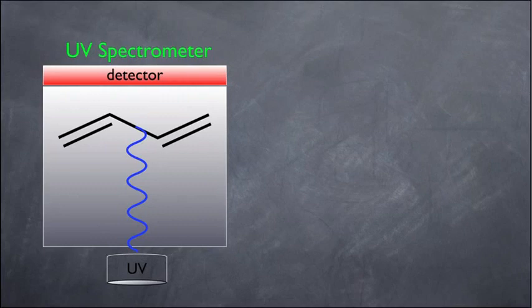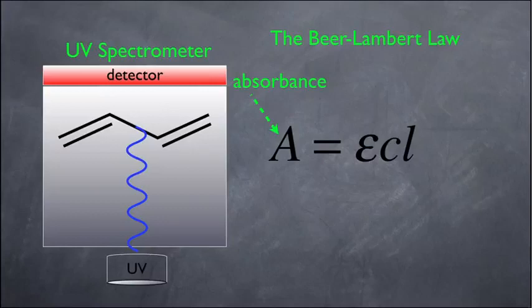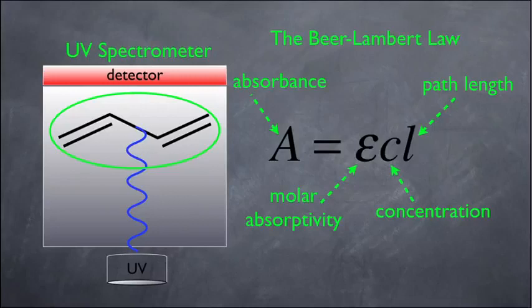Here then, one other aspect we should know is that there's an equation that relates to the UV spectrometer, and that equation looks like this, and it's called, I'm not kidding, seriously, the Beer-Lambert law, okay? Basically, what this equation calculates is you plug in the absorbance, right? Remember, that's off the chart. Remember, on the y-axis of our spectrum is absorbance. You can plug in absorbance right there. Here, you could calculate what's called the molar absorptivity, which is epsilon. Here you plug in the concentration. That's the concentration of your sample. And L in the equation right here is just your path length.